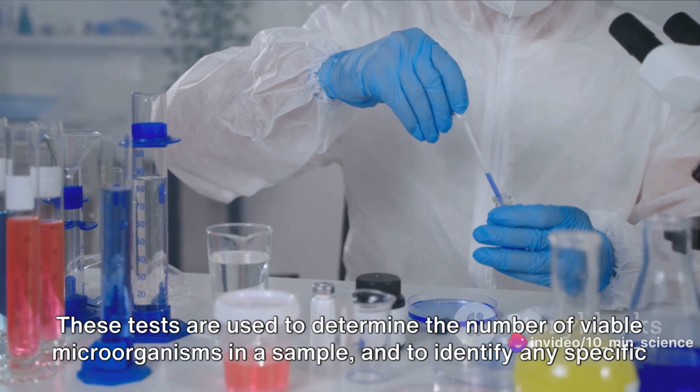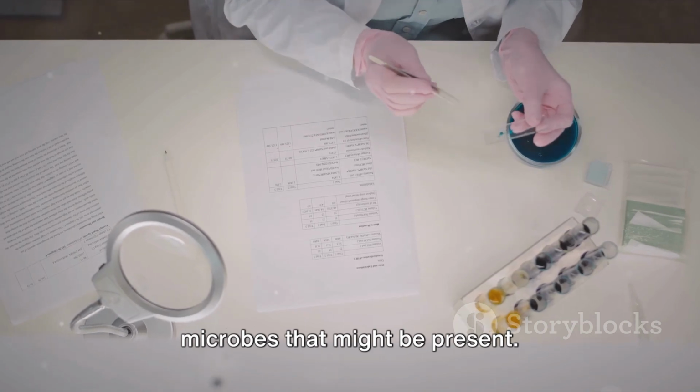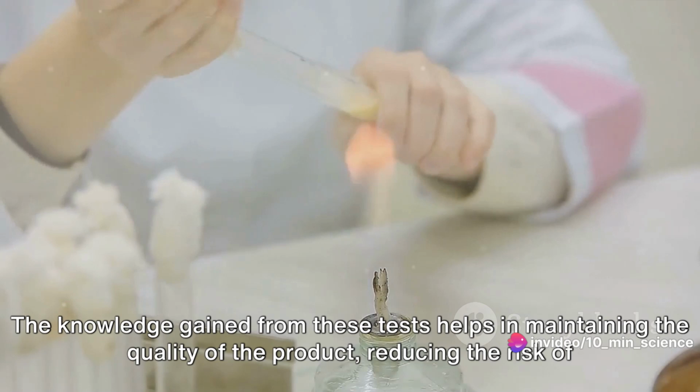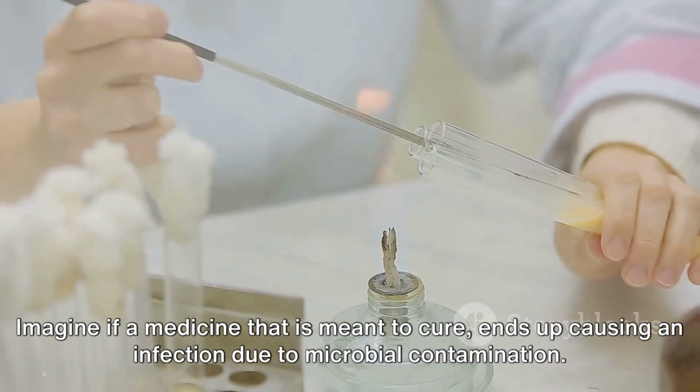These tests are used to determine the number of viable microorganisms in a sample and to identify any specific microbes that might be present. The knowledge gained from these tests helps in maintaining the quality of the product, reducing the risk of contamination, and ensuring the safety of the consumer.